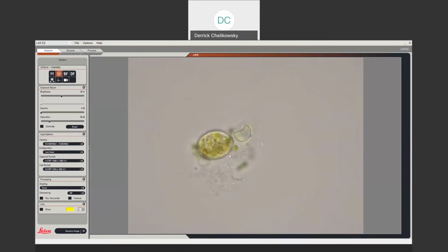But I don't see a flagella. I was hoping to show a flagella. Right there might be a flagella. Actually, yes, that is a flagella. If we take a look, there's the... Oh, that's so cool. Here we go. Take a look right here.